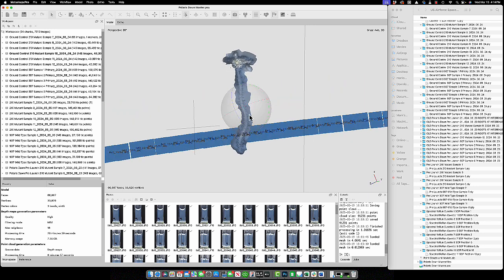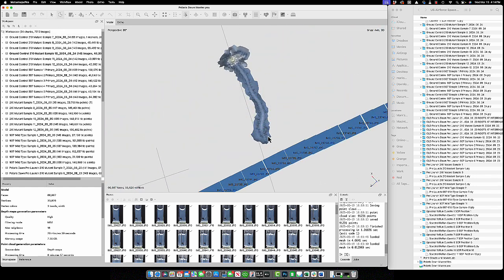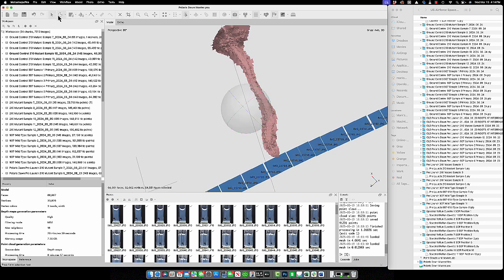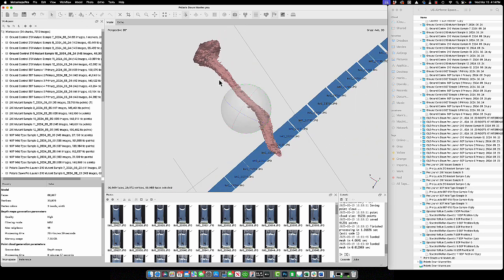But there's a lot of triangular noise outside because, again, the backside is incomplete. So we want to clean that up a bit. And just like we did with our point cloud, you're just going to follow around the root structure. And we're going to do a crop function. And we can keep getting closer and closer to this just to refine it a bit more. So get a little bit closer to that root. Okay, and that's what we're left with. So this is how we create a model from that root.